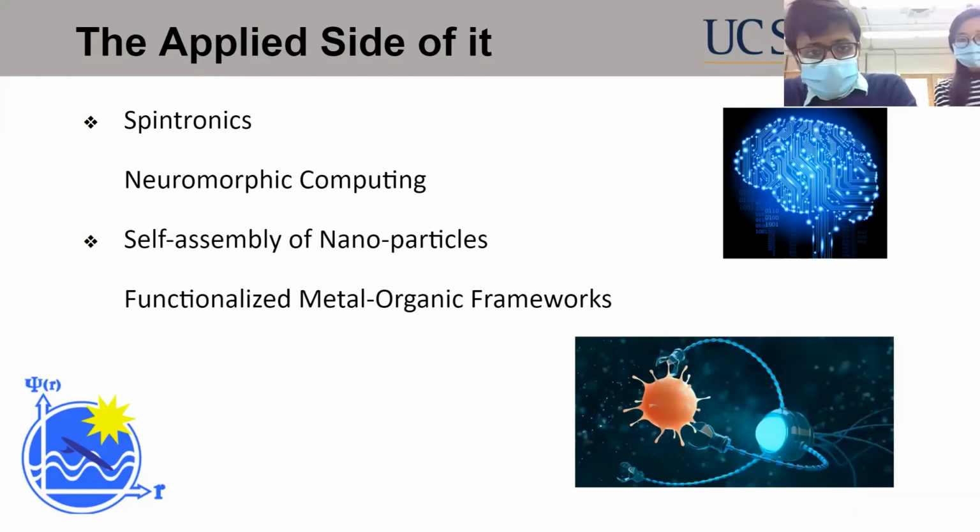And self-assembly of nanoparticles, which Dong is leading, where we are studying how the nanoparticles are self-assembled so they can be functionalized. Say, for example, there are 5 nanoparticles, and that can behave like an angle or like a clamp or something like that.